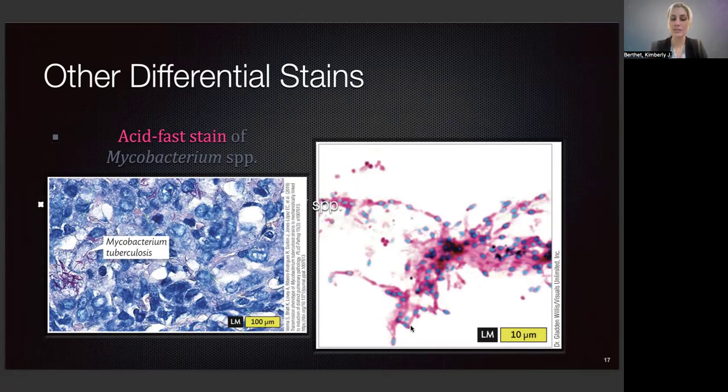This is the microorganism that causes tuberculosis. We can take what we call a sputum sample, something that is coughed up from the lungs, and we can analyze it for the presence of these microorganisms. These microorganisms, Mycobacterium tuberculosis, actually have a waxy layer on them. And this waxy layer prevents the stain from actually adhering.